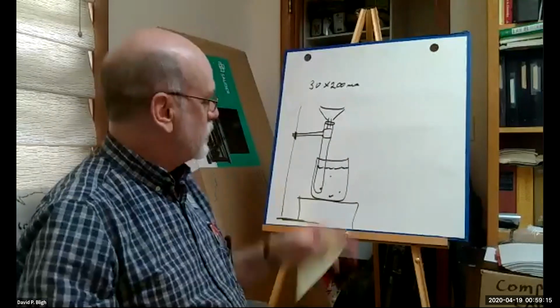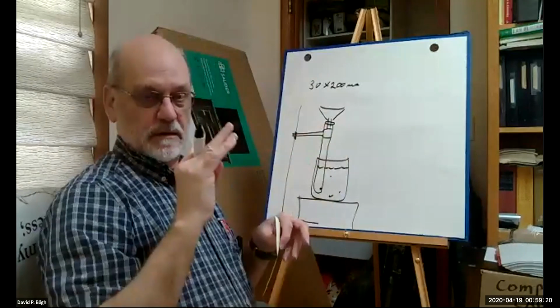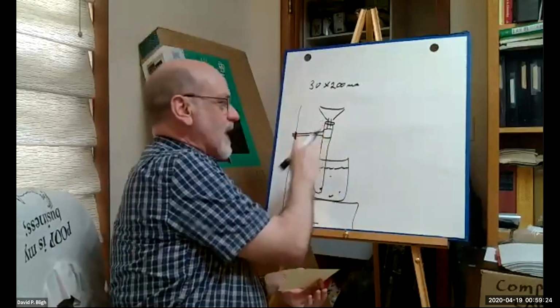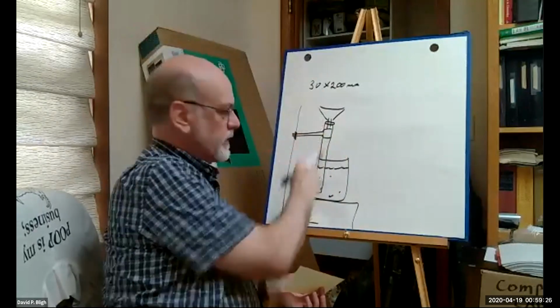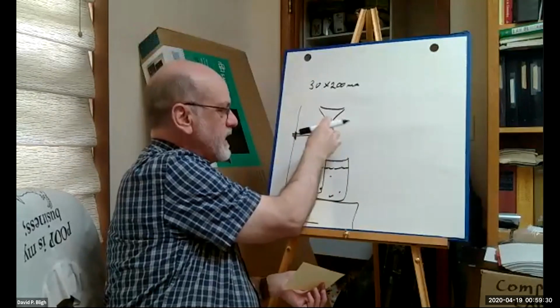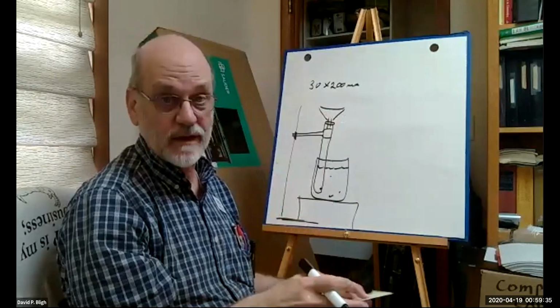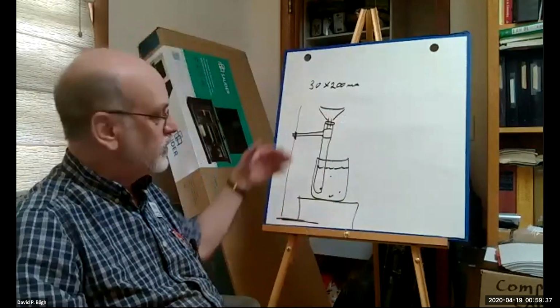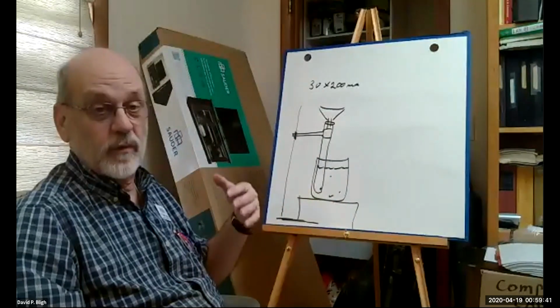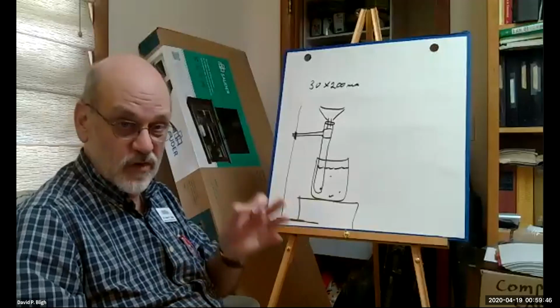Right? And we use a wide opening funnel. It's called a powder funnel, to add our components to this tube, because we don't want any of them to be up here around the top of the tube, right? Because that part of the tube is not hot. And you need everything that you put in the tube to melt. And when we add our benzoic acid, it's got to go into solution, and the concentration is critical.